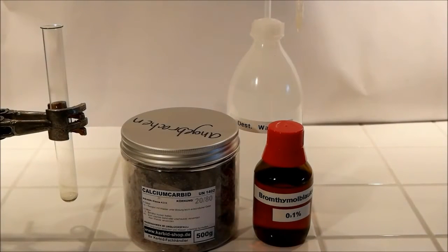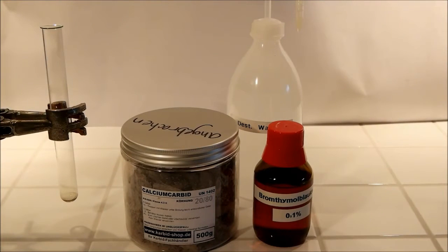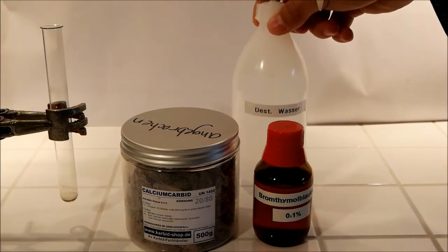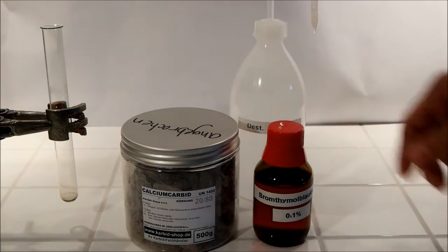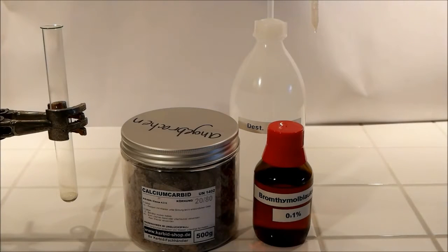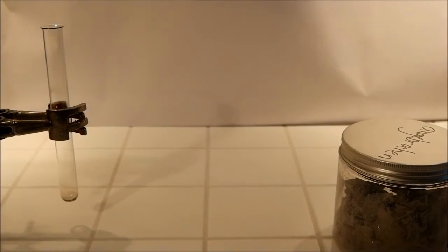Today I'll show you a few interesting things about calcium carbide. If you mix it together with water, you get a gas, which is ethine, C2H2, and it's very flammable, and I think we're going to try that. But first I want to show you something else.